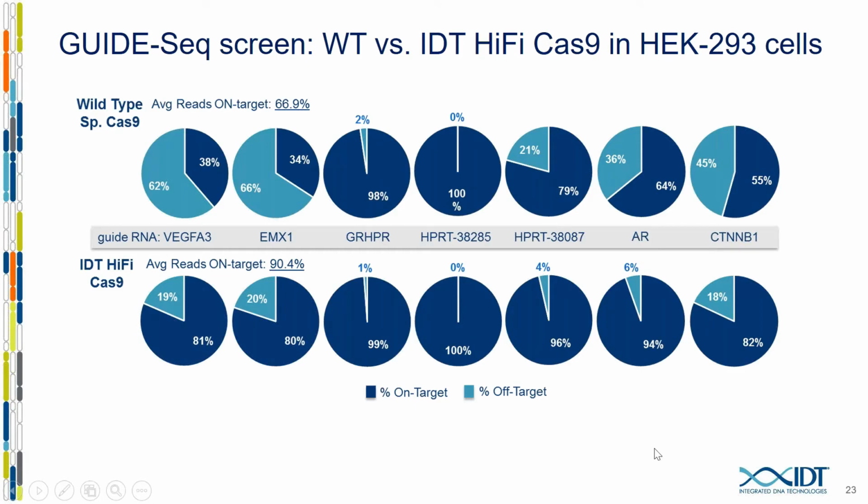And through a lot of investigation with the GUIDE-seq procedure, we've come to appreciate that it is very, very good at identifying what an off-target site is. It's very good at giving you the total repertoire of edited sites. Where it begins to fail, however, is how quantitative it is when assigning an indel frequency to each locus. That's why we went on to using this 2-step procedure.